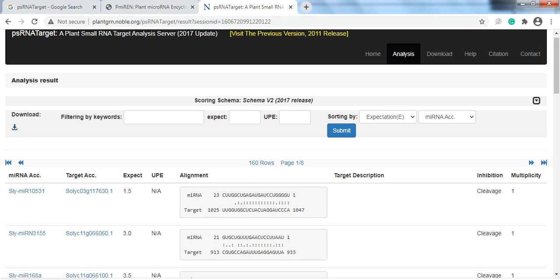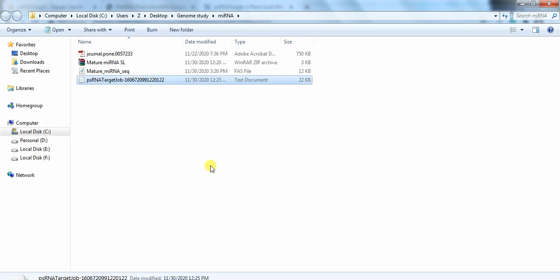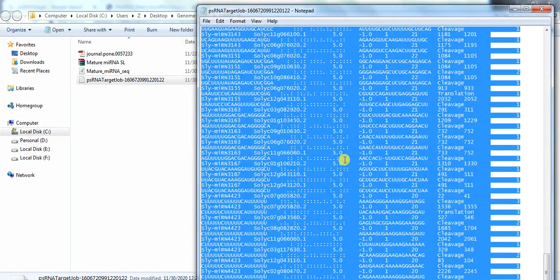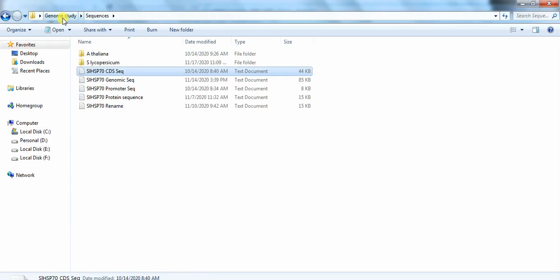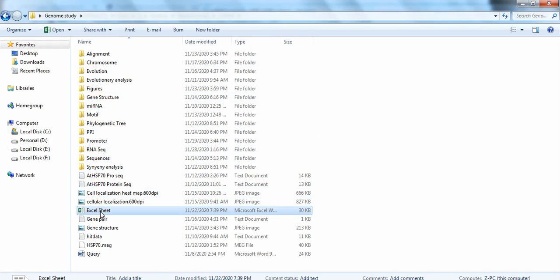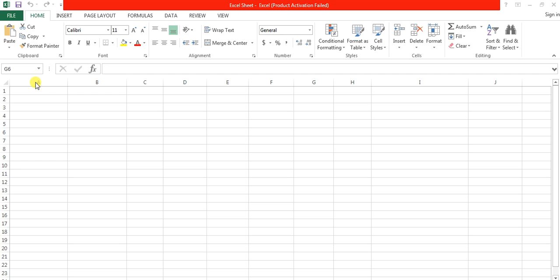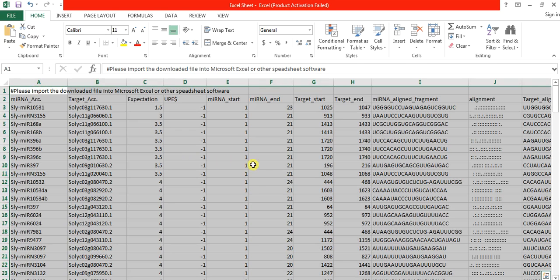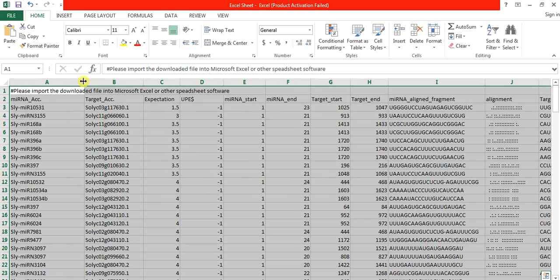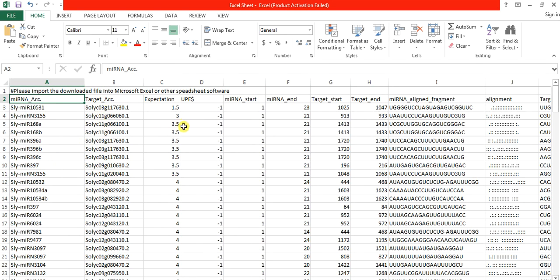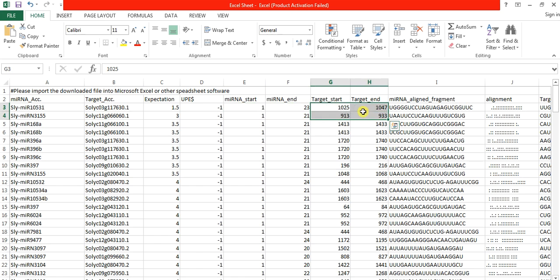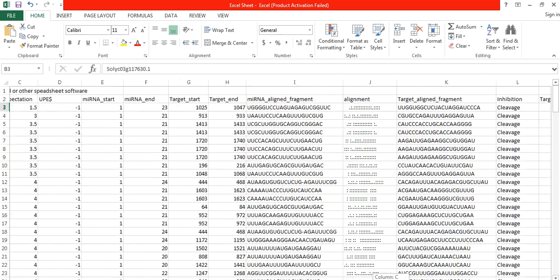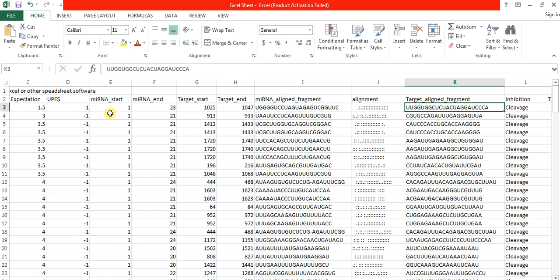Open the downloaded file, select all, copy, and then open the Excel sheet. Paste all the microRNA sequences found. You can see the microRNA name, the gene, the start and end positions of the microRNA (length about 23), the start and end of the target gene, and the sequence of that microRNA.